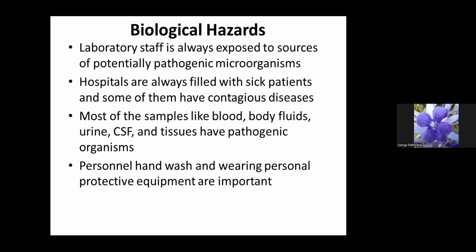Let's discuss biological hazards. Laboratory staff are always exposed to sources of potentially pathogenic microorganisms, and hospitals are always filled with sick patients, and some of them have contagious diseases. Most of the samples like blood, body fluids, urine, CSF, and tissues have pathogenic organisms. Therefore, personal hand washing and wearing personal protective equipment are very important when handling specimens.